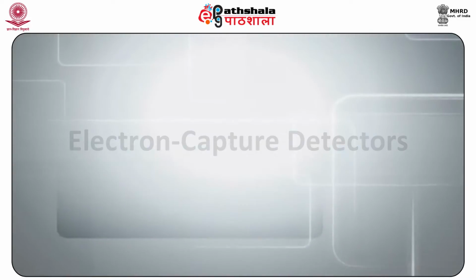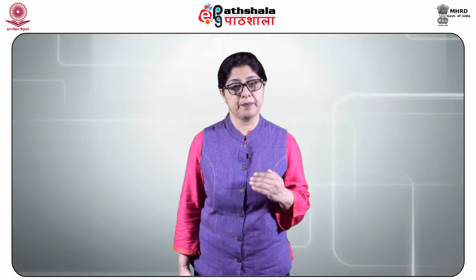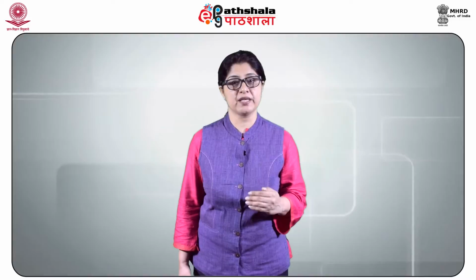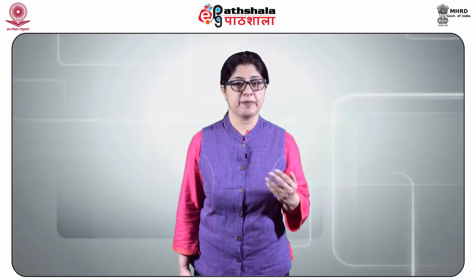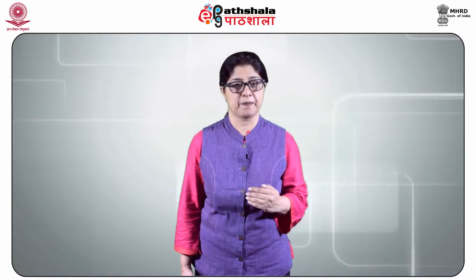Electron-capture detectors. Electron-capture detectors (ECD) are highly selective detectors frequently used for detecting environmental samples. The device selectively detects organic compounds with moieties such as halogens, peroxides, quinones and nitro groups, and gives little or no response for all the other compounds. Therefore, this method is best suited for applications when trace quantities of chemicals such as pesticides are to be detected and other chromatographic methods are unfeasible.